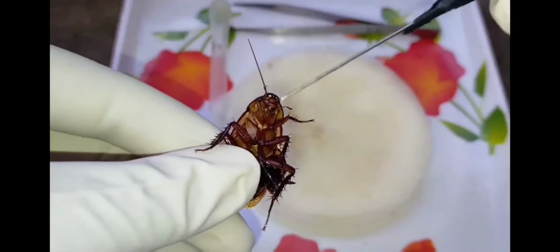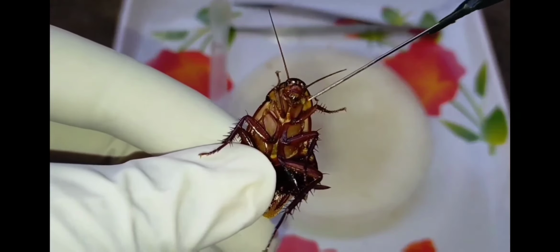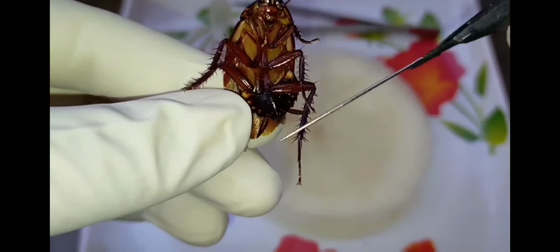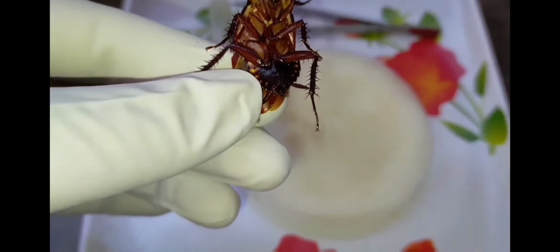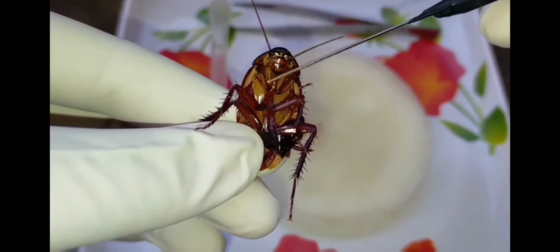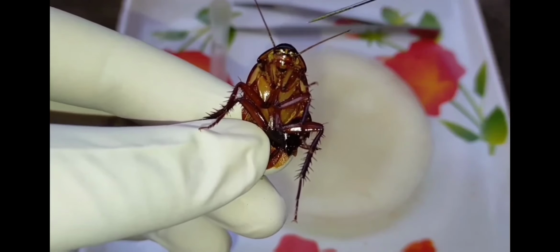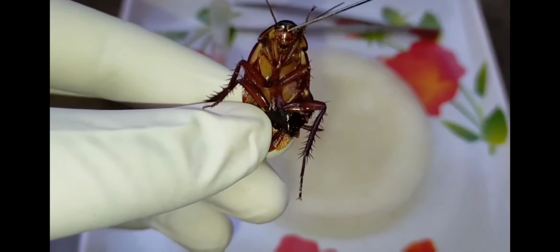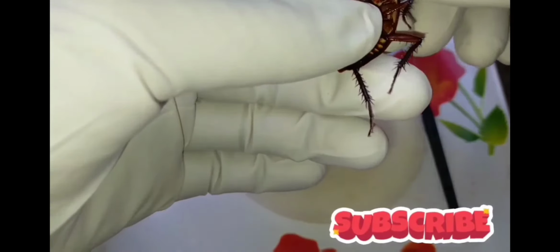First of all, you can see this is the head part, then the thorax part and the abdomen. First, the head. The head is triangular in shape and lies entirely at right angles to the longitudinal body axis.